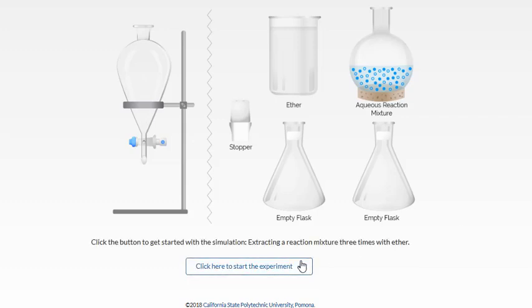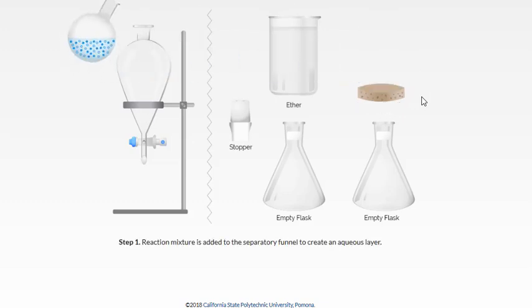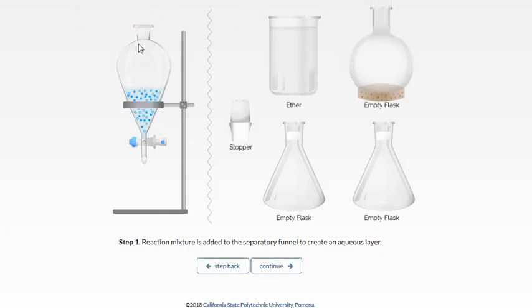What we have here is a reaction mixture that has been quenched by adding water, so it's now aqueous. It's got a lot of components dissolved in it, and we're going to pour that in. You can use a funnel up top to pour it more carefully. Make sure that your stopcock is closed before you start adding liquids, because every chemist at some point has accidentally poured liquid into a sep funnel with an open stopcock.